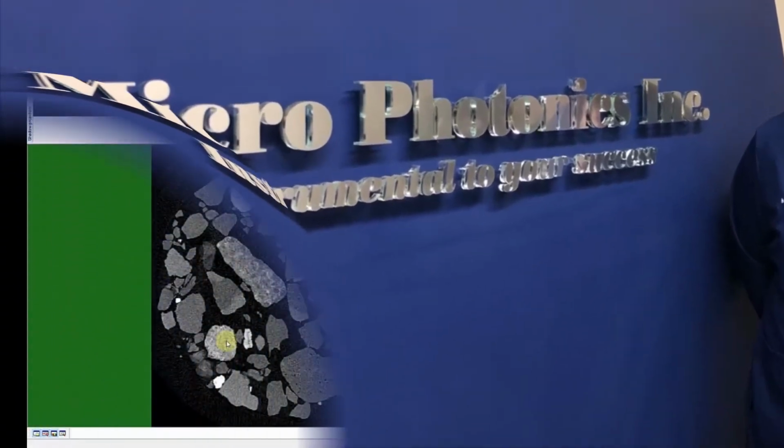Each month we're going to be going through some new tips and tricks videos to help you get the most out of your SkyScan micro CT instrument. Let's go ahead and jump into this month's tip.